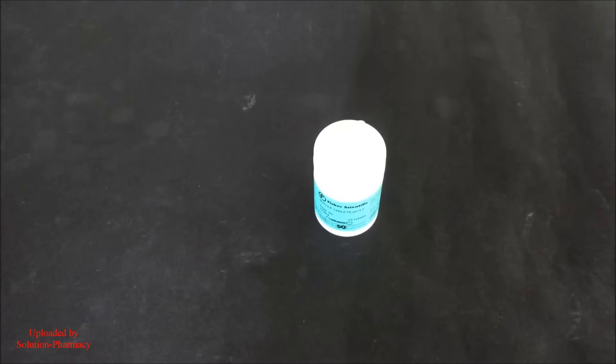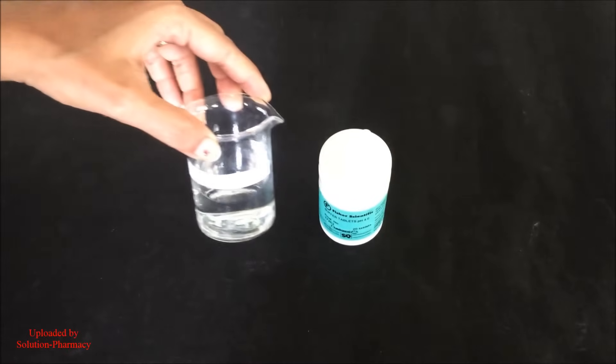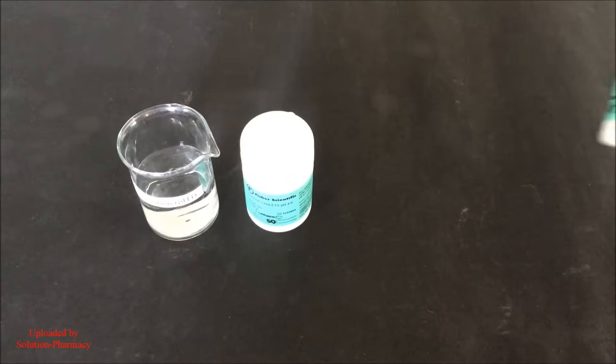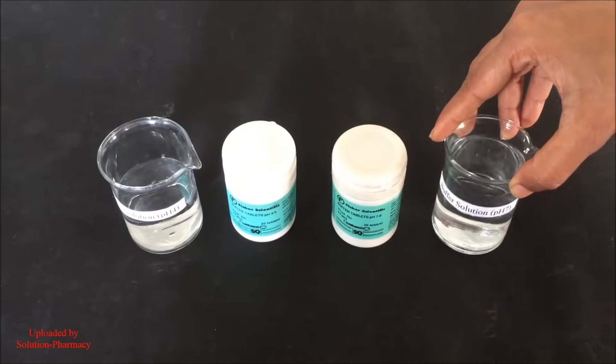To prepare the pH 4 buffer solution, dissolve one tablet of pH 4 in 100 ml of distilled water, as per the instructions given on the container. This is the prepared standard buffer solution of pH 4. In the same way, prepare the standard buffer solution of pH 7 by dissolving one tablet of pH 7 in 100 ml of distilled water.